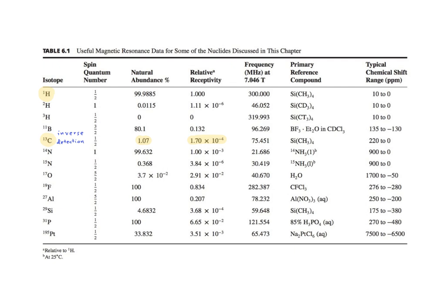For organic compounds, the most common elements are carbon, hydrogen, nitrogen, and oxygen. The most common isotope of nitrogen is nitrogen-14, but that has nuclear spin of 1 and has not been widely used. However, N15 NMR spectroscopy has been developed.